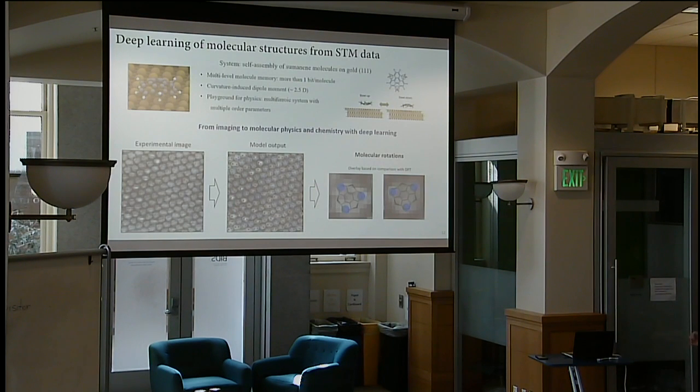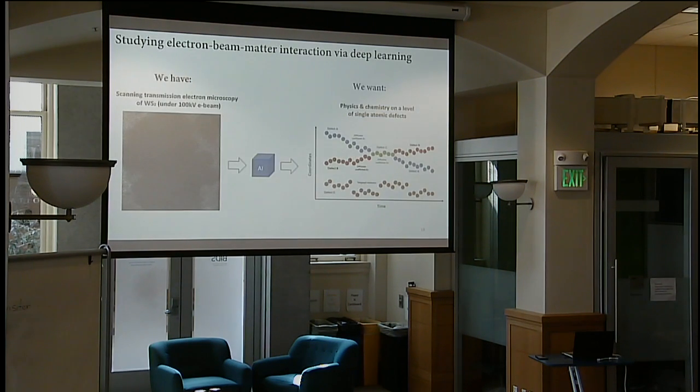OK, let me skip this slide. Here I just wanted to show it can be applied to other microscopy techniques as well. OK, so the next problem that we are interested in: we are very interested in studying electron beam matter interaction.